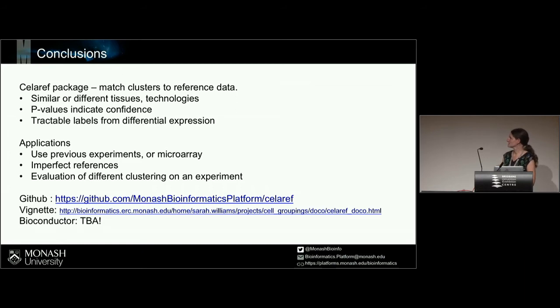So obviously this is on GitHub. It's not in Bioconductor yet, but that's coming. And there's a vignette here with a lot of the example data and how to generate it that I've talked about here.